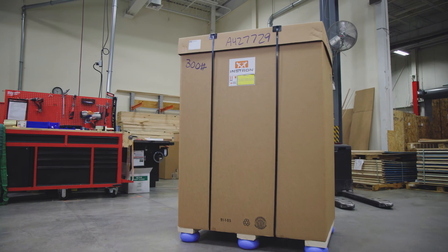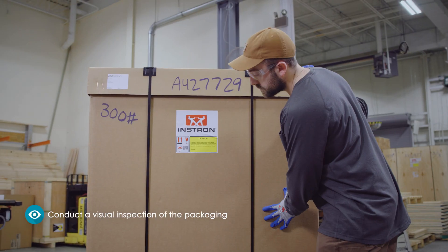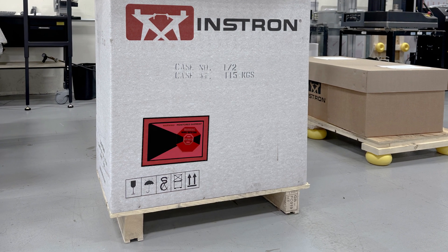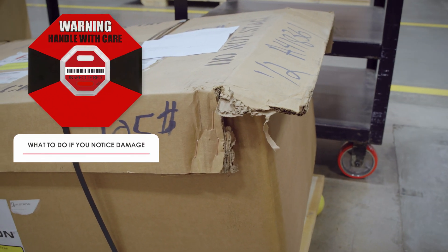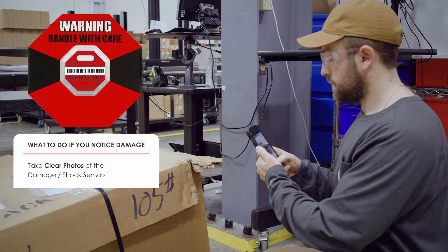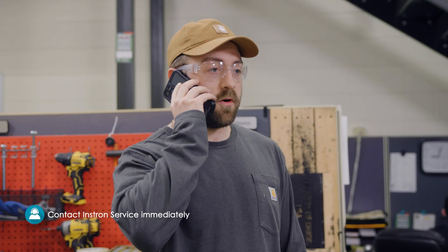Before accepting delivery of your Instron Universal testing system, it is important to conduct a visual inspection of the packaging to look for any signs of damage. If your package is equipped with shock sensors, you'll also want to check to see if any have been activated. If you do notice damage or if any of the shock sensors have been activated, you should take clear photos of the damage and/or shock sensors and do not accept the package from the carrier.